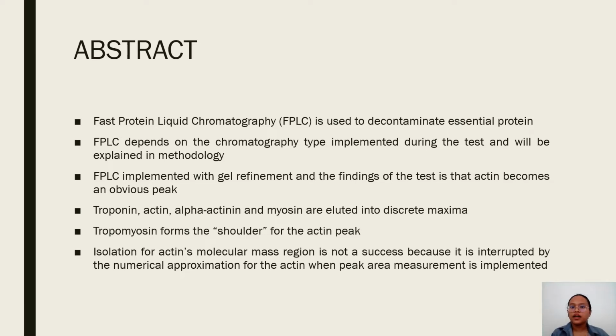Through examination of the findings from this testing, FPLC implemented with gel refinement is employed for the actin's isolation from a solution of myofibrillar complex polypeptides.